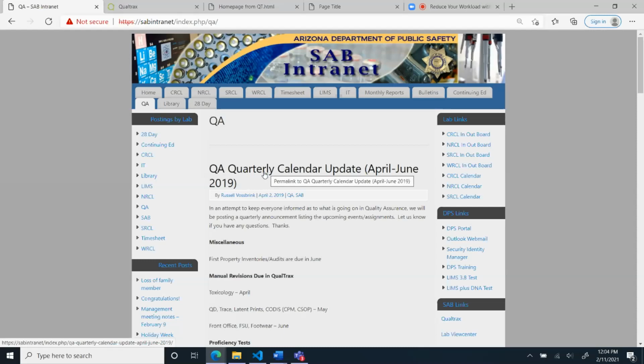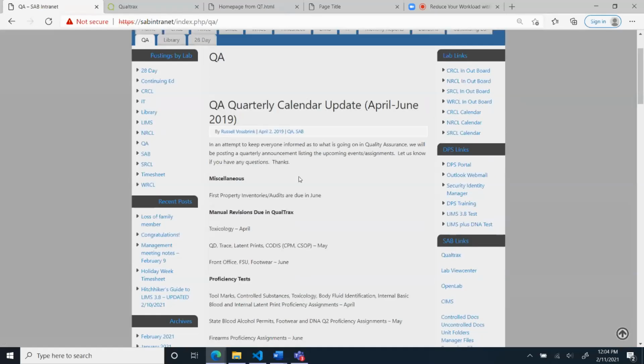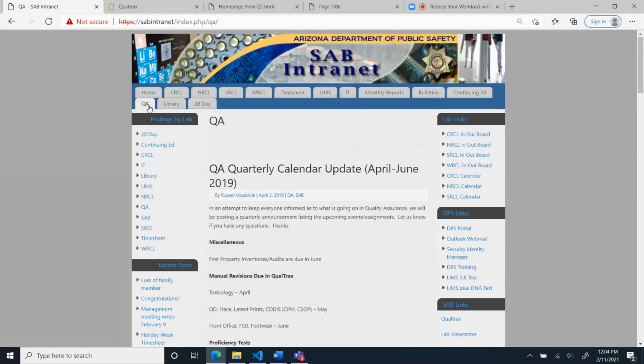It's got some QA important stuff and PTs. We had a couple of interns a couple of years ago, and so there's a lot of quality message that we can push out, but we haven't updated it in a while, and it's just buried in this tab.